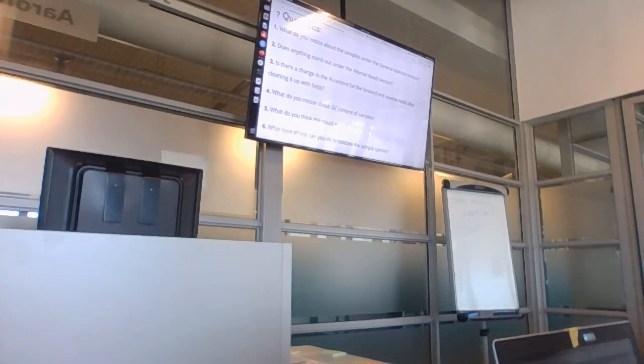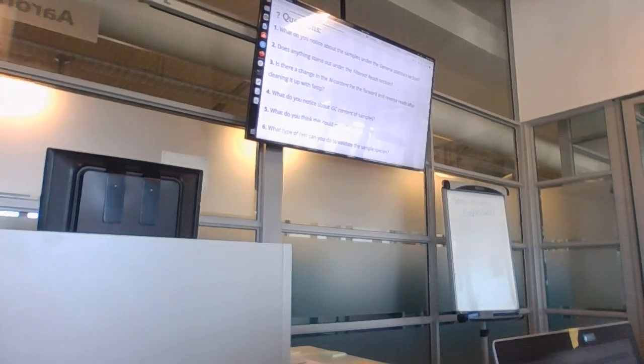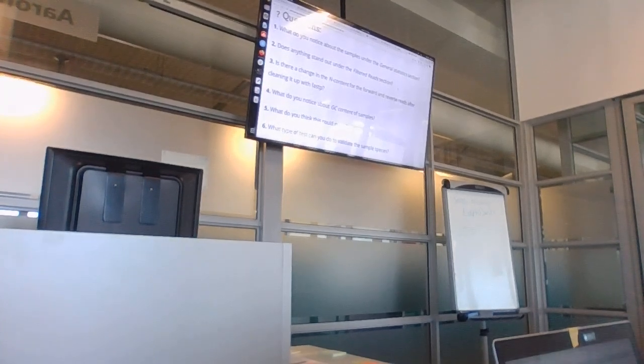Yeah, that's fine. So this was the first step that we did. You have to click that, and it's a report. Then you click on this drop down to go to the shape data set table. You see it automatically has a -1 and a -2, so if it wasn't, it would be up there.